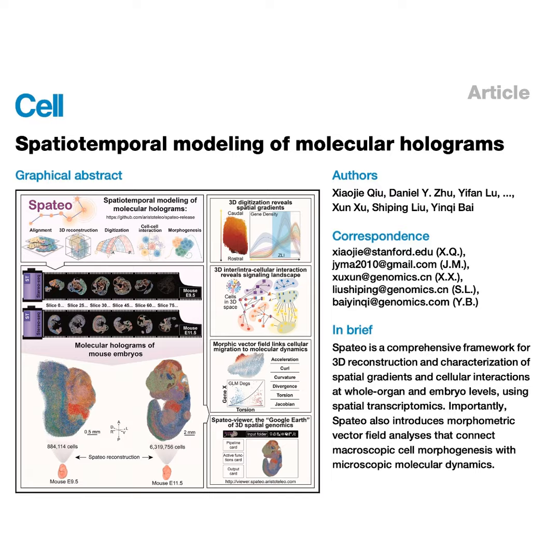Yeah, it does. If you use a rigid algorithmic transformation, like just rotating or shifting the entire slice to find a best fit, you aren't actually correcting the localized warping. You're just moving the distortion around. So to fix a stretched region of tissue without ruining the perfectly fine tissue right next to it, the algorithm needs to behave more like a selective elastic grid. Exactly. And the Spateo framework handles this by employing non-rigid alignment driven by Gaussian processes. Okay, Gaussian processes. Break that down for us.